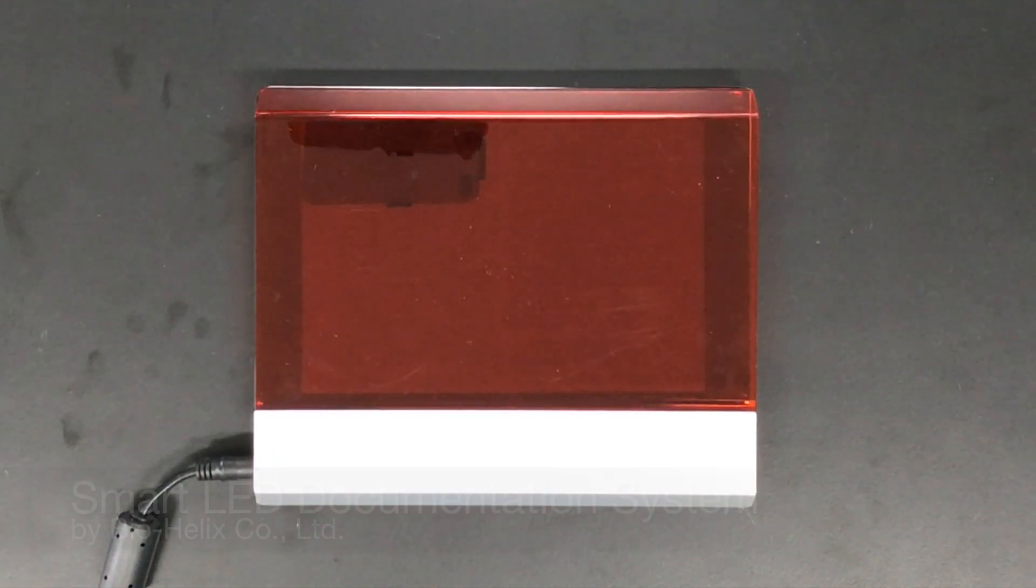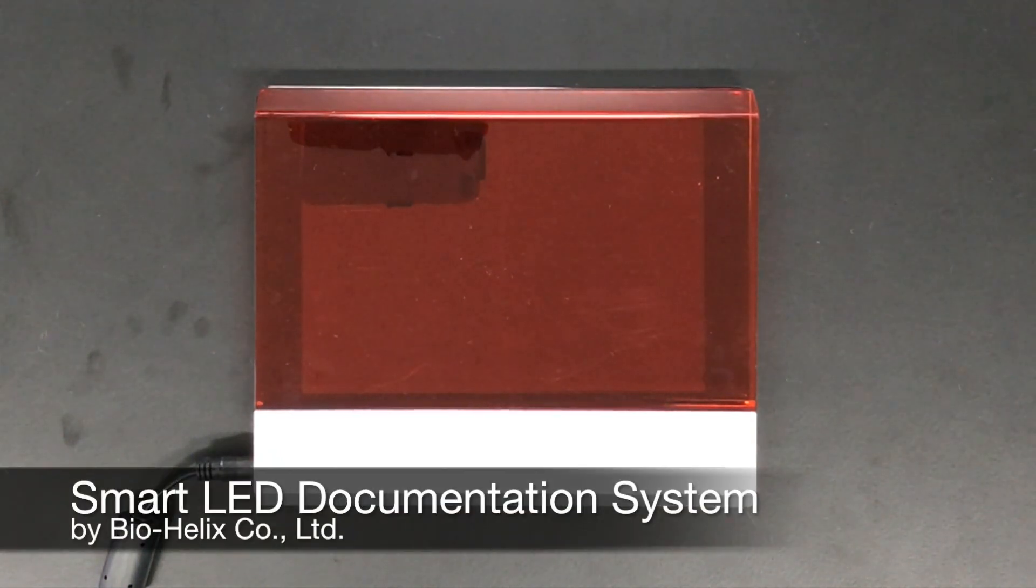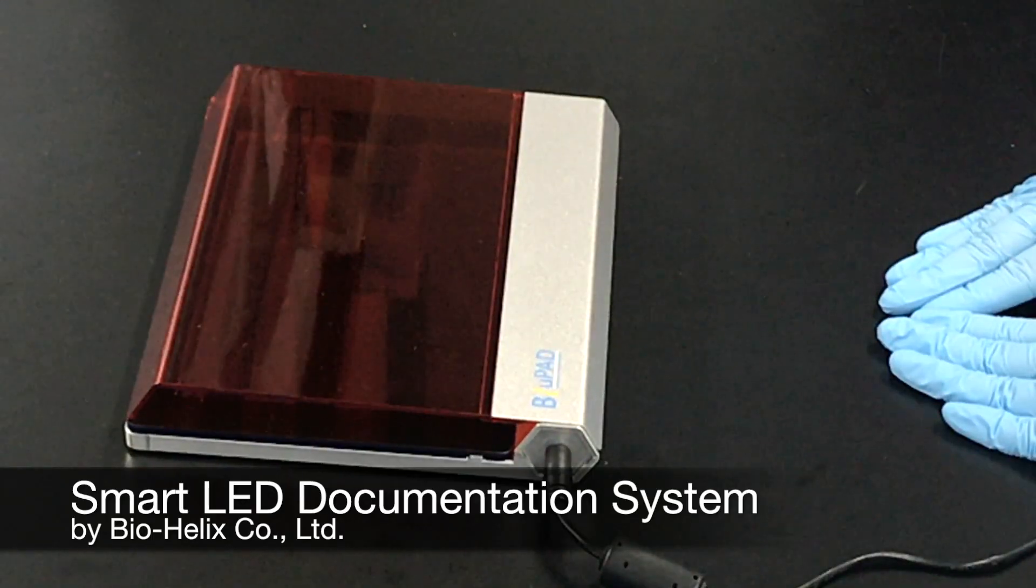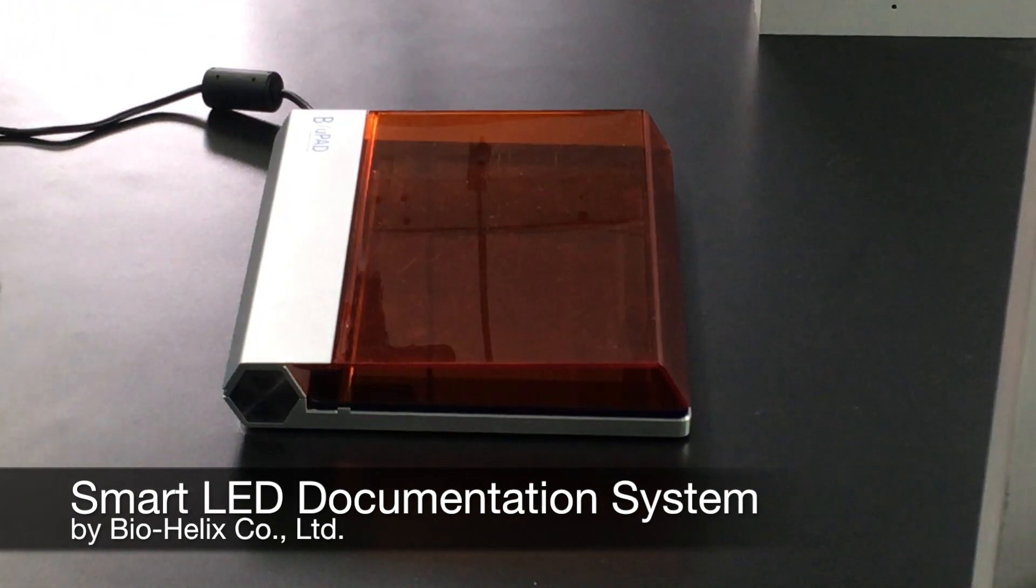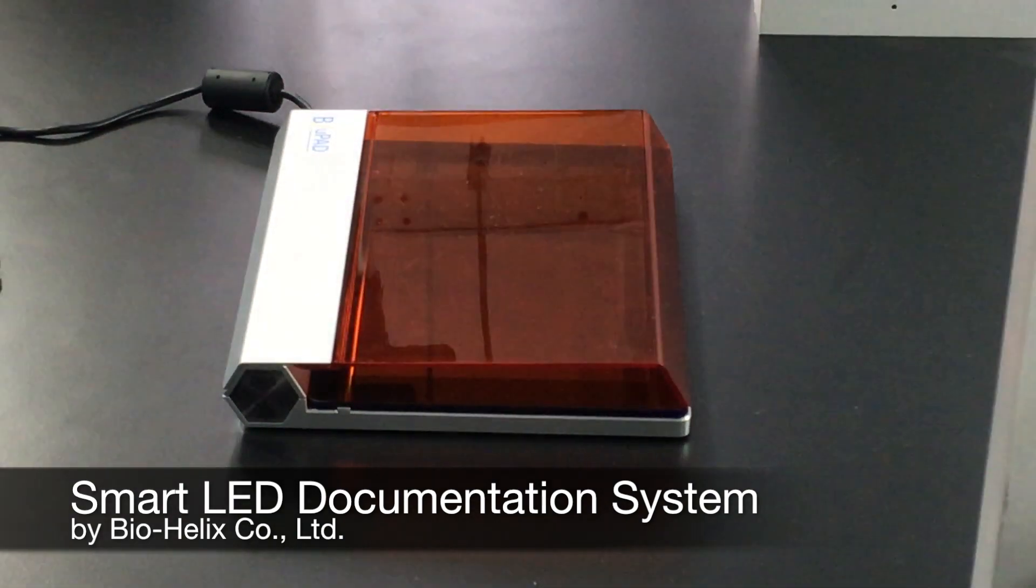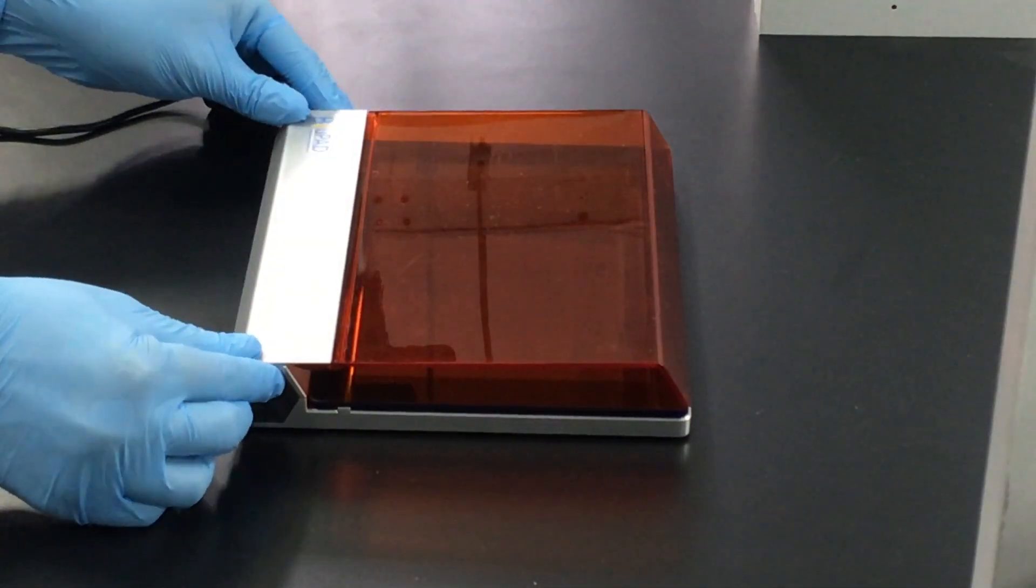Today we would like to introduce this revolutionary smart LED documentation system to researchers working in gel electrophoresis and looking for a safer alternative to the UV transilluminator and use of ethidium bromide.